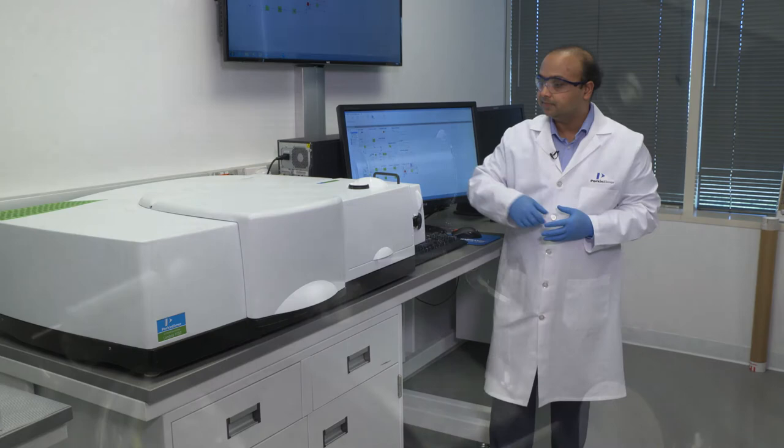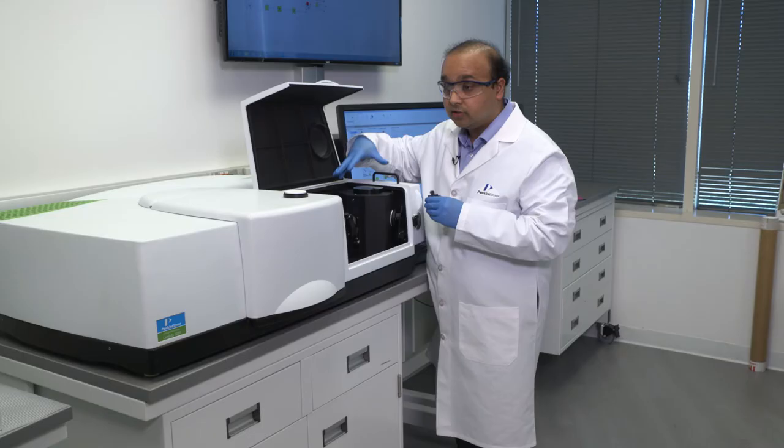And then remove what we call the specular plug on the sphere. Now this specular plug, once we remove this, will allow the reflected signal to be dumped outside the sphere. So whatever then remains inside the sphere is the diffuse reflectance of the particular sample.